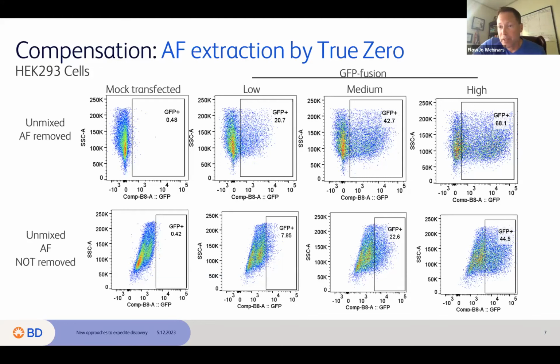Caveats: autofluorescence is different from cell type to cell type to cell type. You would want an example for each kind of cell. We will do it as a parameter and extract it like a parameter. And so you could use more than one at a time, but just remember that the autofluorescence you're measuring is for whatever cells you were showing us in that example.